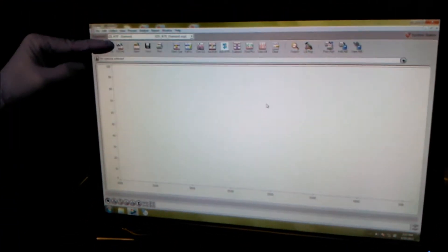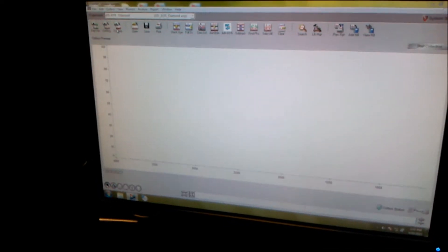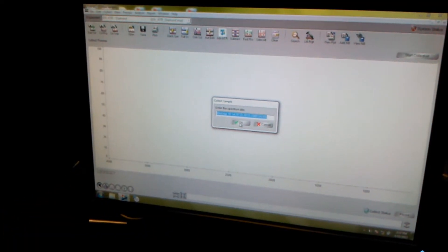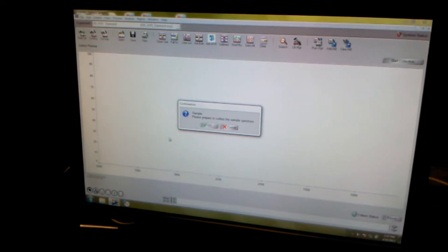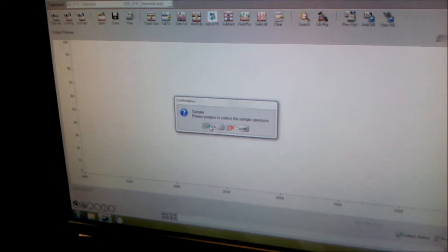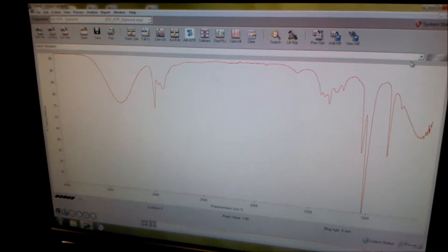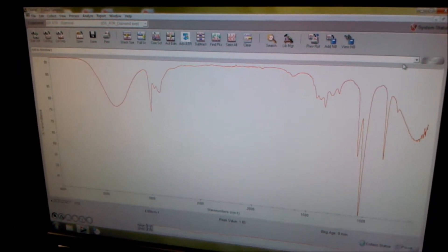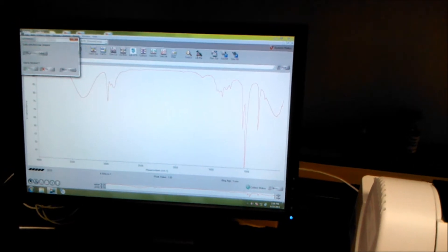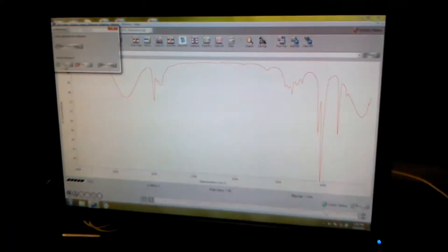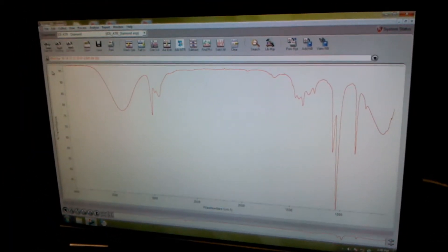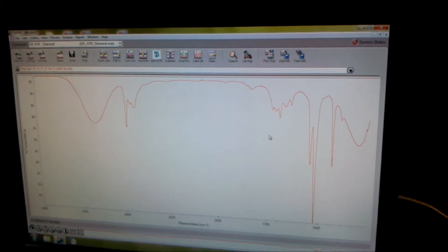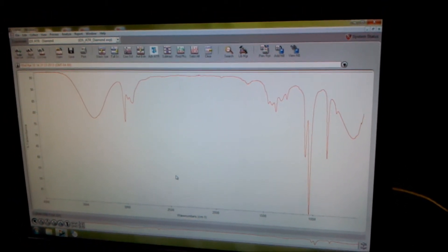Now we're ready to collect samples. We're going to collect our sample. Enter the spectrum. If you want to change the title, you may. Sample is prepared, okay, and then you start collection. And it will run through another 32 iterations. Now it's done running the 32 iterations. Data collection has stopped. We do want to add this to the window, so you click yes. There is your spectra of the product that you have sampled.